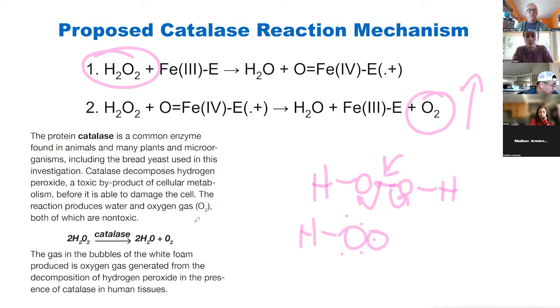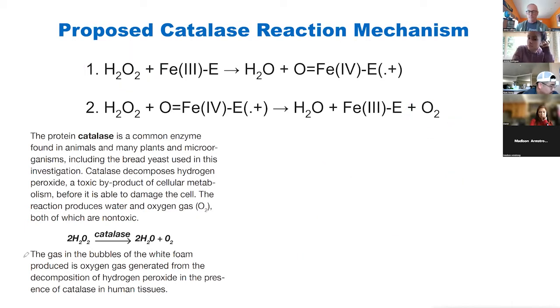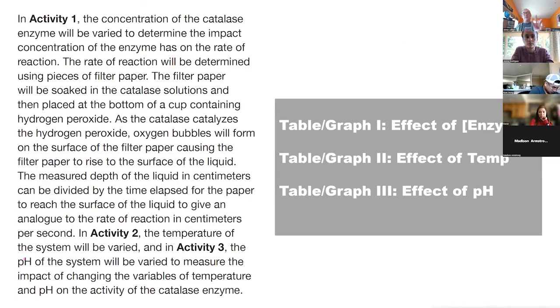Okay. So we're going to be looking at three different activities. I'm going to do one of them with you, and you don't really have to do all of them today. The effect of enzyme concentration is fairly straightforward. The effect of temperature is fairly straightforward. The effect of pH takes a lot of setup.